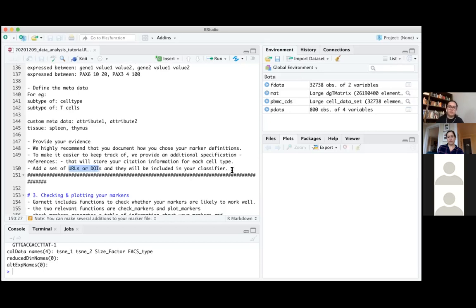So basically the take home from this is a lot of things can be added in the marker file, and the more specific your marker file is, the better your classification is going to be. So I would say the revisiting happens in this step, where you make sure that you only proceed with a marker file you're almost 100% confident about.